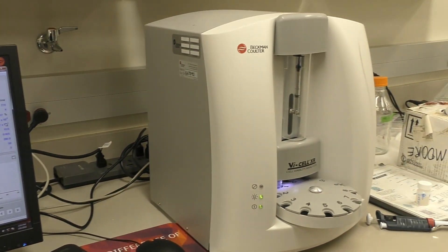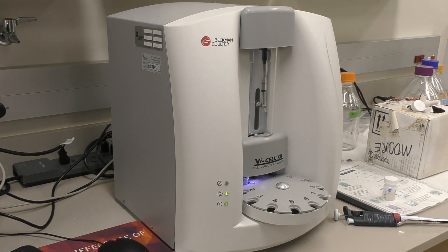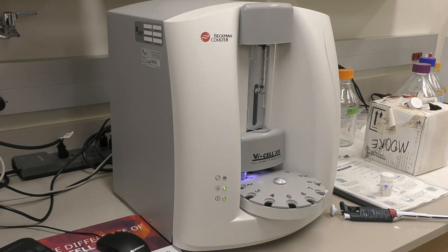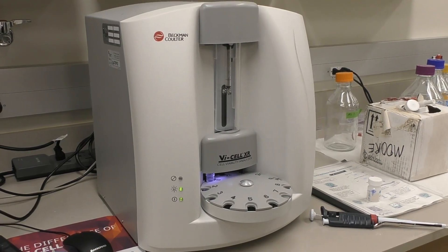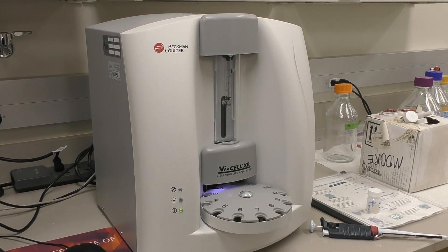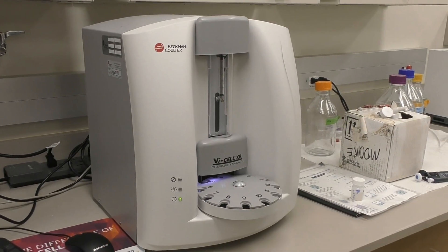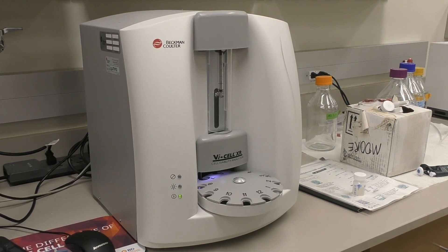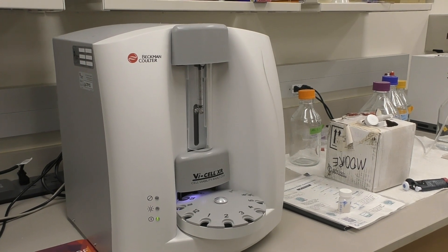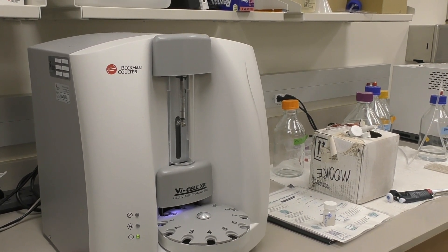Now it is done and it rinses itself. The concentration range that works for this instrument is 50,000 to 10 million cells per ml. If it's below or above those limits, it's less than optimal.